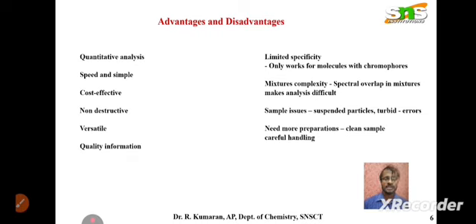But overall, UV visible has more advantages, since it is cost effective and measurement friendly, so researchers can easily handle it and make the preliminary confirmation. So it is very important to review UV visible spectroscopy. Thank you so much.